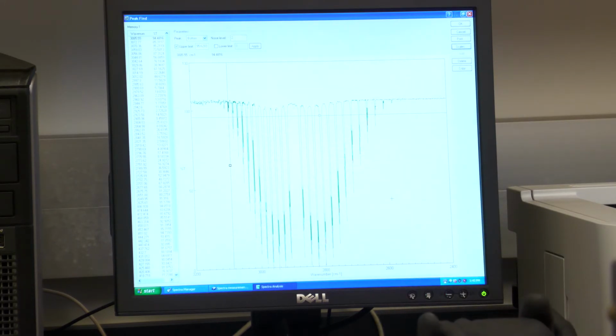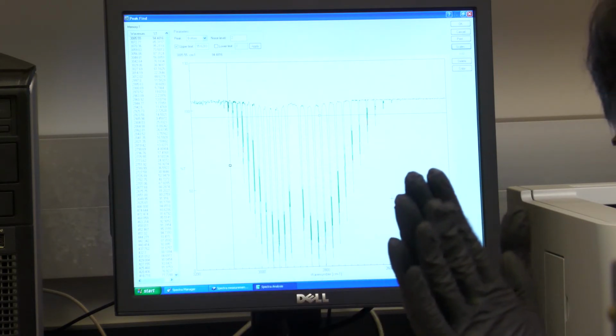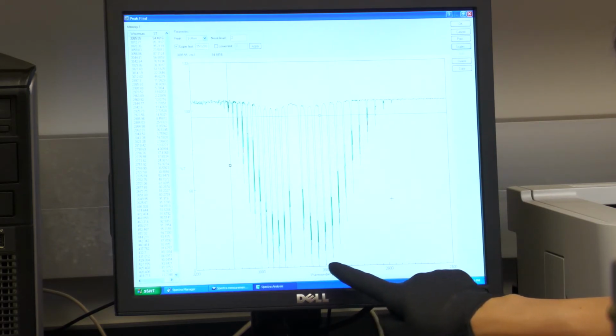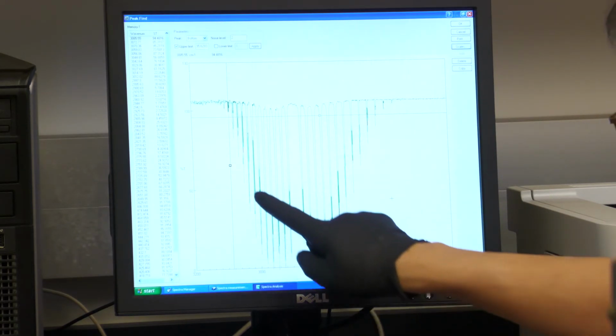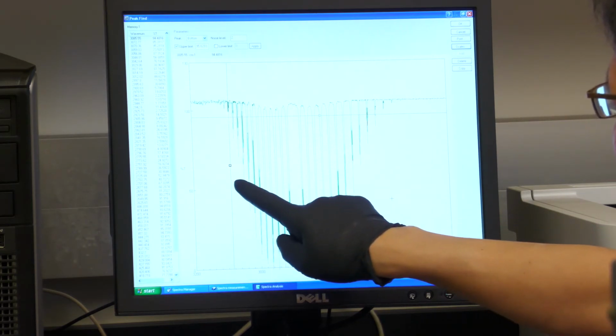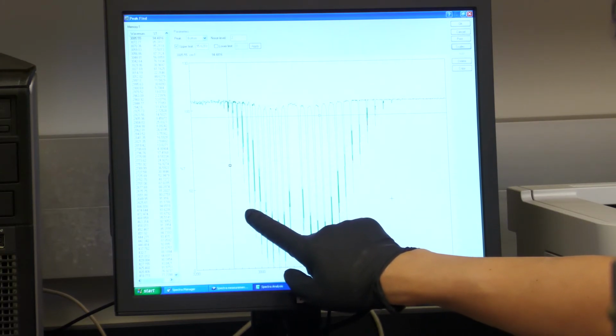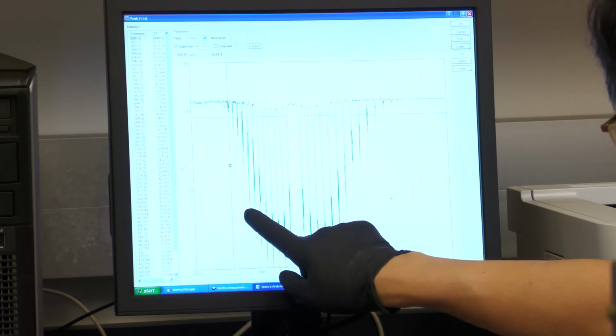So Cl is chlorine. The chlorine atomic mass is 35, right? Another is 37. So one is a little bit more abundant than the other one. So you have 2. However, you just need one of them. You just compare either the bigger one or the small one, so that means your bigger one compares with the bigger one. So the bigger one is the heavy one, chlorine 37 or 35.